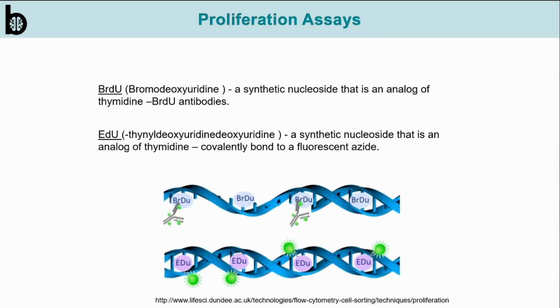Then we also saw in the video that we evaluate proliferation. You saw that the dentate gyrus has smaller neurospheres, and the SVZ has bigger neurospheres. We can evaluate proliferation by adding a thymidine analog, which is BrdU or EdU. They are both thymidine analogs. So when there is proliferation, during mitosis, this BrdU or EdU is incorporated instead of thymidine. Then we can detect it during the staining.